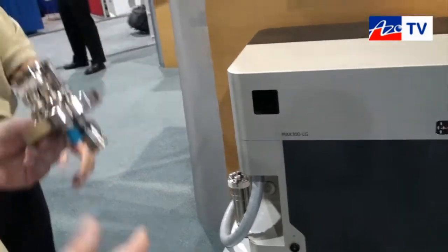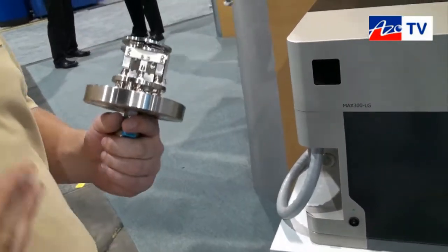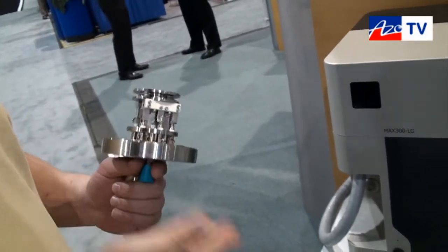With Xtrell, this being our seventh generation process analyzer, we've taken numerous features that we've learned throughout those years and implemented them in this analyzer.